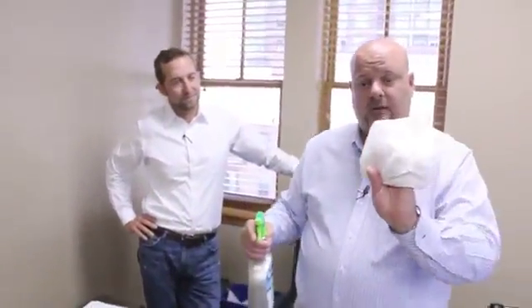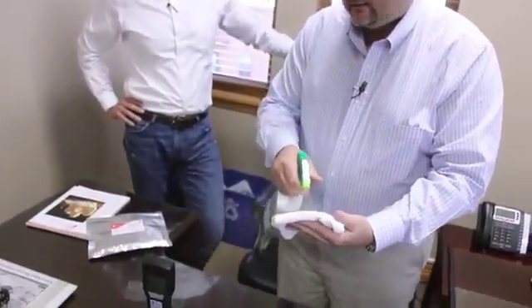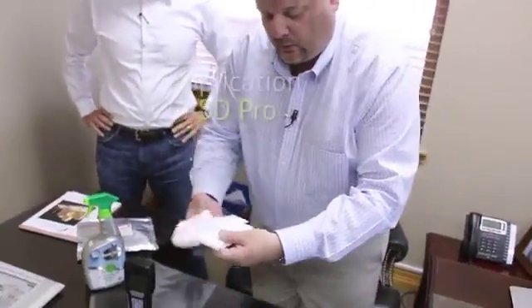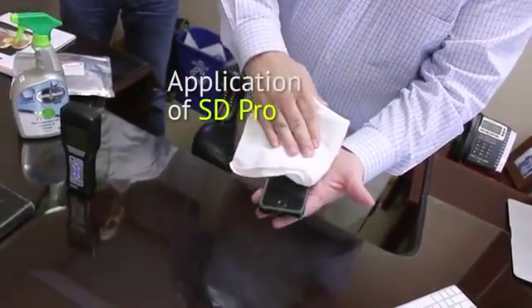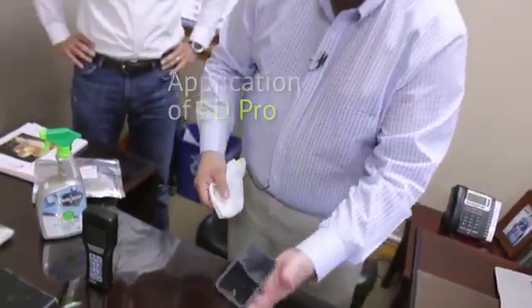Because we're working with an electronic, we're going to use a microfiber towel. We're going to heavily saturate that towel. I'm just going to wipe down the surface, and it's going to leave a sheen behind. We're going to allow that sheen to dry, then we'll do our follow-up test.